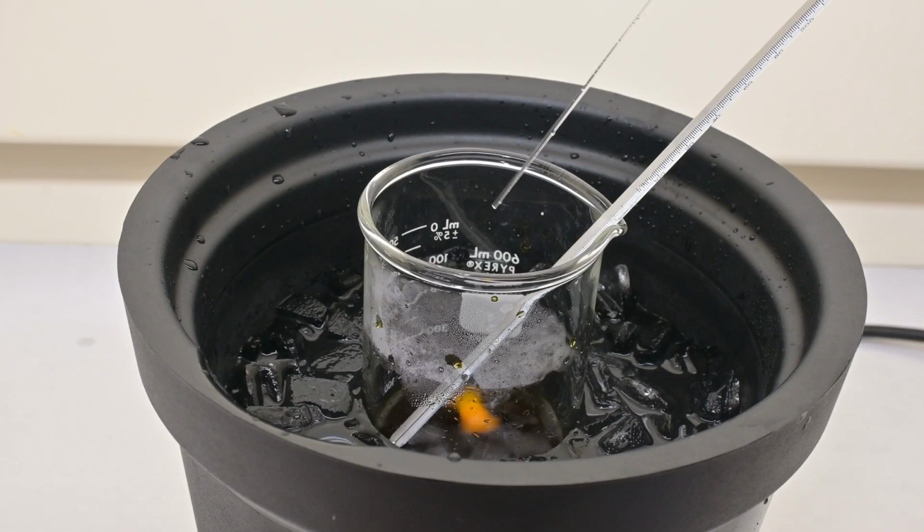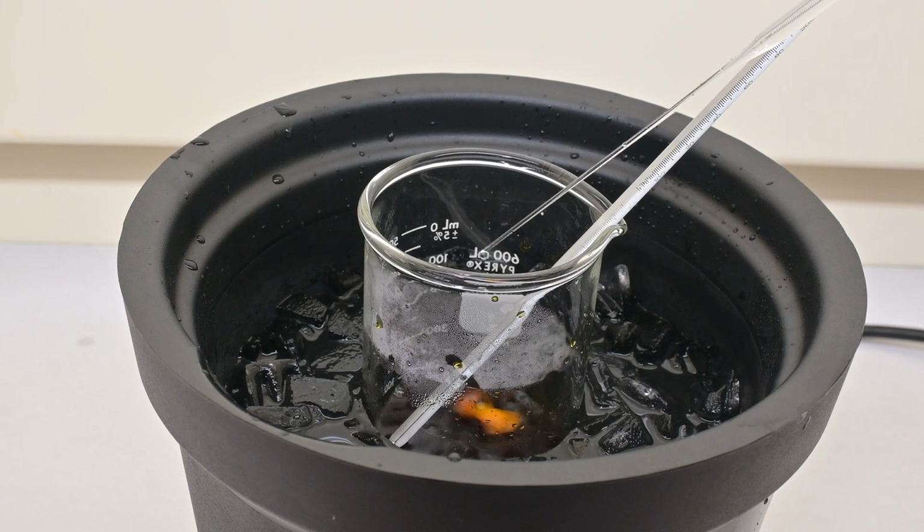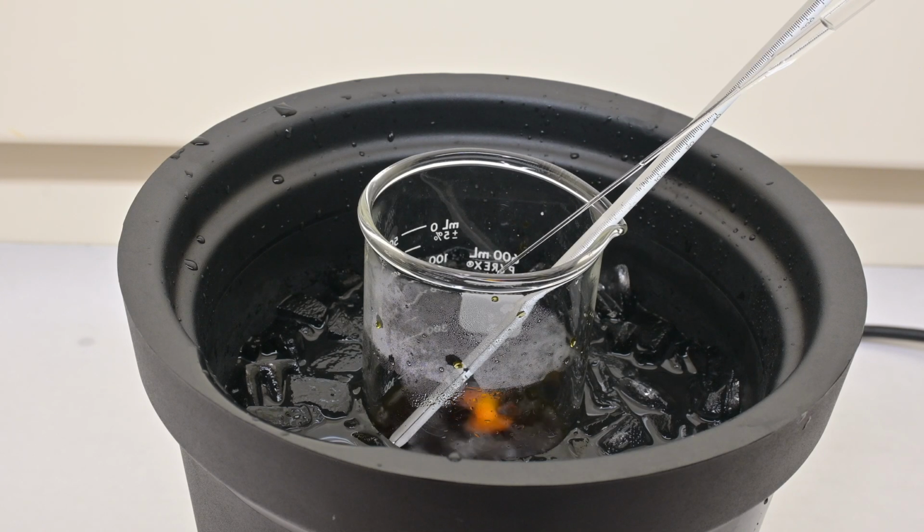We continue to stir the solution vigorously and add a mixture of 3 milliliters concentrated hydrochloric acid diluted with 5 milliliters of water drop by drop. The reaction is exothermic and produces heat, so we must add the hydrochloric acid slowly so too much heat is not generated. The hydrochloric acid reacts with the sodium nitrite to produce nitrous acid. This nitrous acid causes diazotization, forming the diazonium salt.